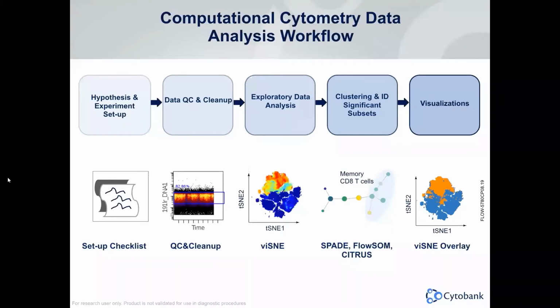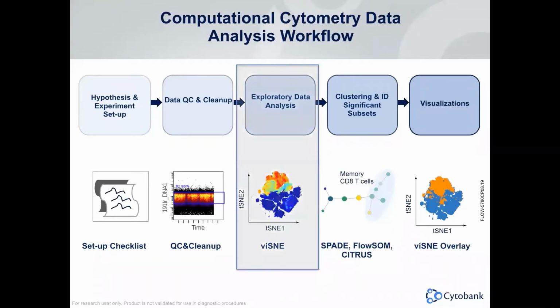And today we will be focusing on the viSNE part. We will introduce the basics, showing you how to start a viSNE run and how to interpret the results in Cytobank.